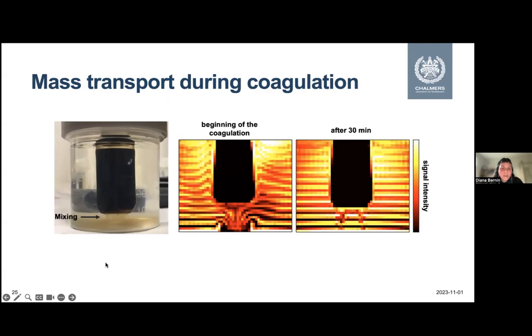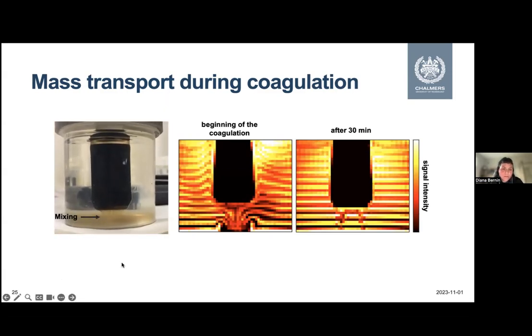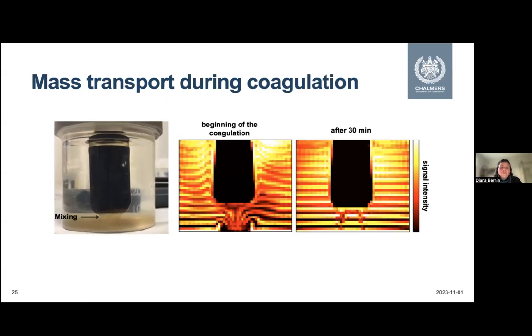It works. So you can see that MEMAC, which is the solvent here, is coming out, but also parts of lignin. And then we have been struggling quite for a while to figure out how can we measure this? How can we use MRI to figure out if it's different when you use different solvents and when is it finished? So here we use the technique which is called saturation slices.